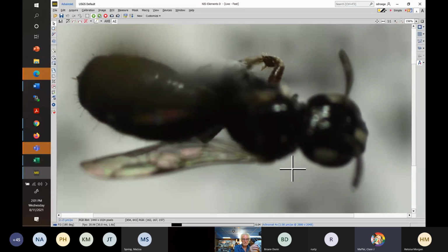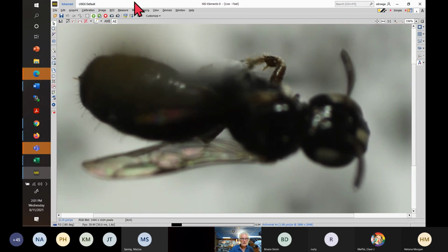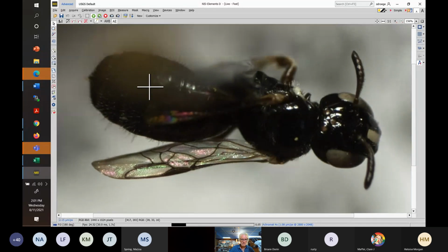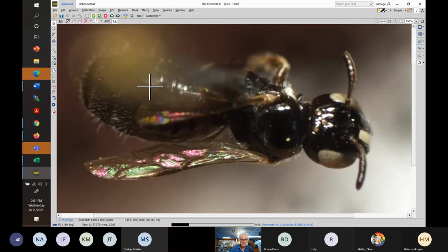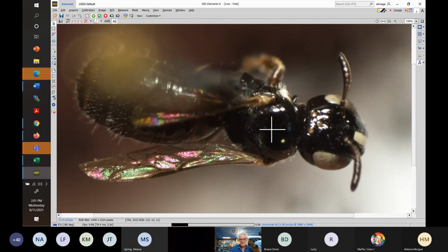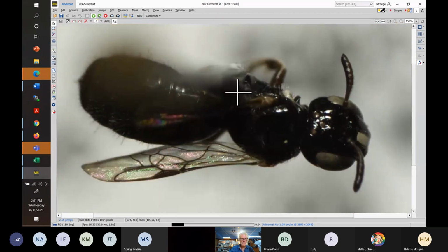Here's cockerelli if people want to see cockerelli. A lovely, fun little thing. Very easy to ID in the east. Now in the west, there's a couple other species that are in the same group that I think may be different. Very glossy, boldly colored, very few pits. And I can't get the lighting to show this dark bee that well. Let's see if, let's do that a little bit. It's basically super glossy, almost no pitting on there. This is also really, really tiny.